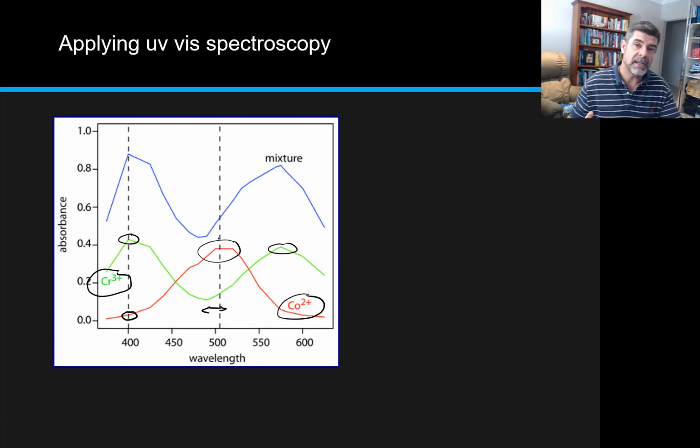So this is why you need to analyze these kinds of spectra to get a sense of which types of wavelengths of light are going to be most likely to be absorbed, and for mixtures that contain multiple ions, what you might need to set your desired wavelength at in order to get the most accurate results that you can, and therefore have absorbances that are going to be linked most directly to one of these ions and not have results affected by one of the others.